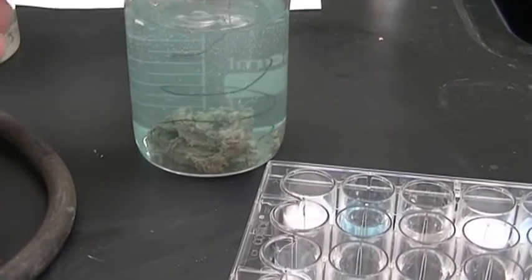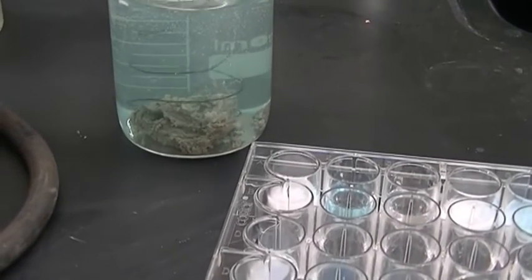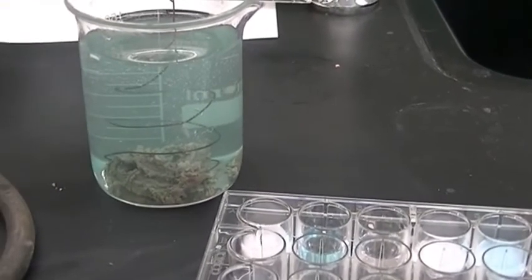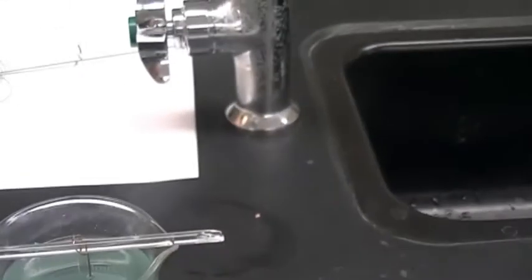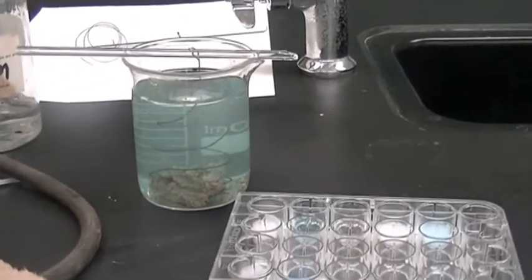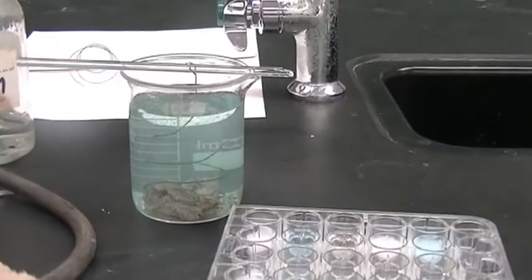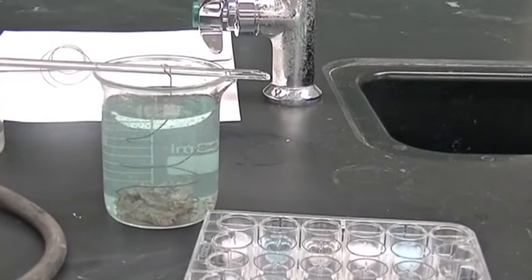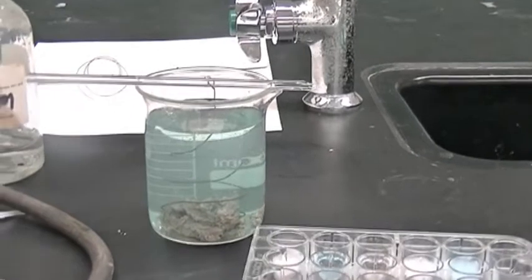All right, and so now the silver is all at the bottom of our beaker. Now it's going to keep reacting with the exposed copper. And I will test it. It looked like there was a very small amount of silver left. So we will probably continue with our experiment, even though we know that there's going to be a small amount of silver that is still in the solution. But we are definitely not out of copper. There is plenty of copper coil that will take the silver out of the solution.